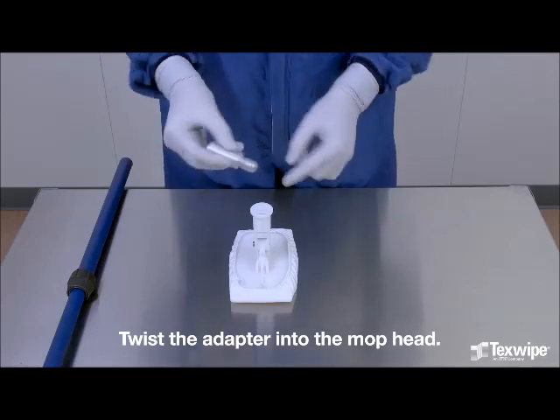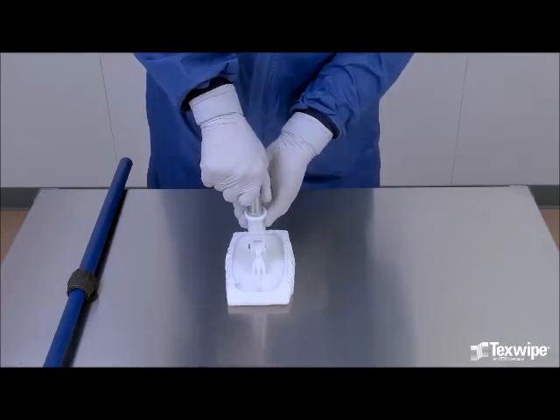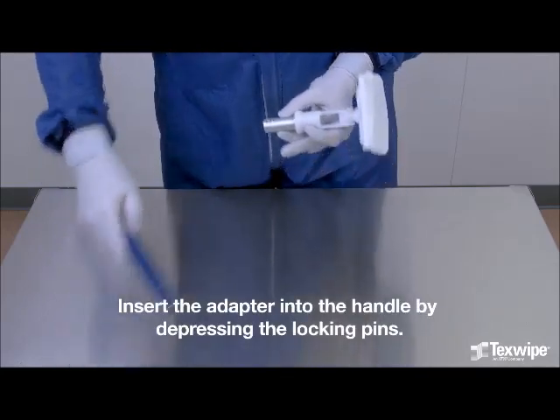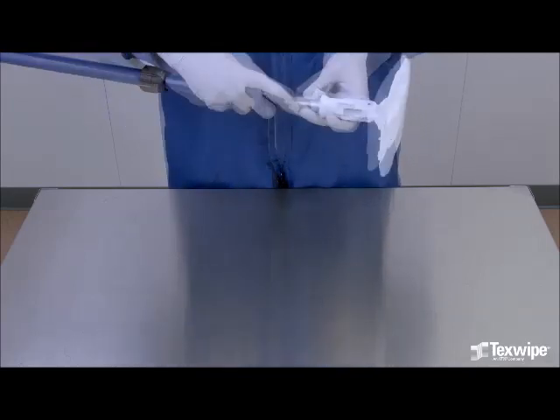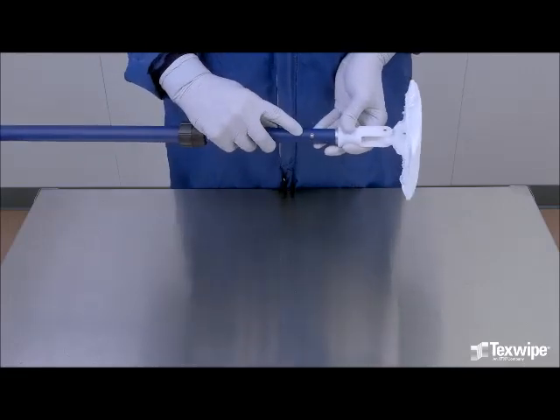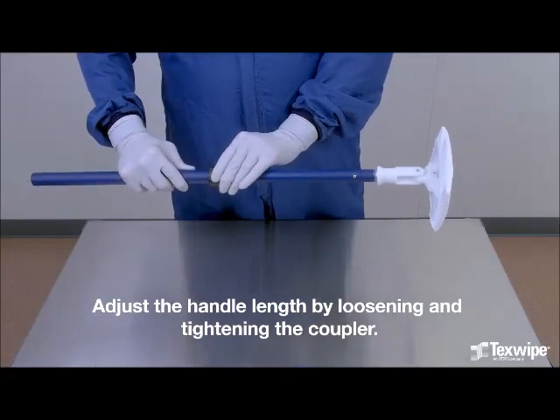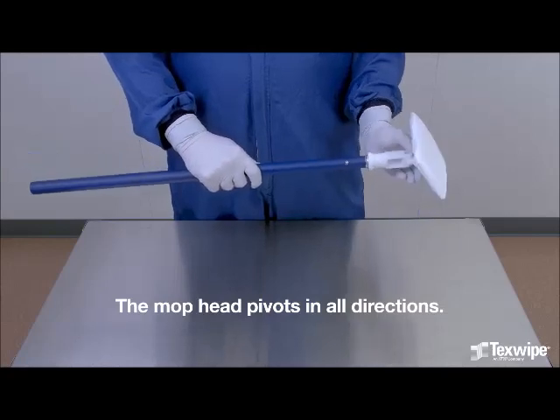Twist the adapter into the mop head. Insert the adapter into the handle by depressing the locking pins. Adjust the handle length by loosening and tightening the coupler. The mop head pivots in all directions.